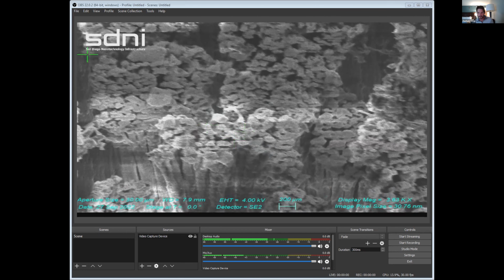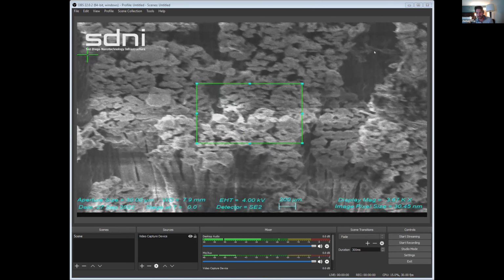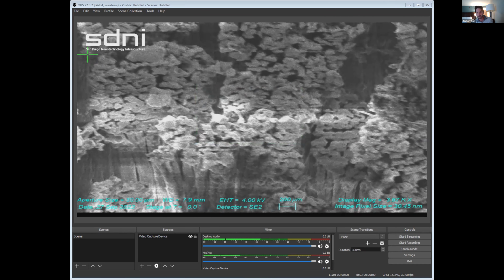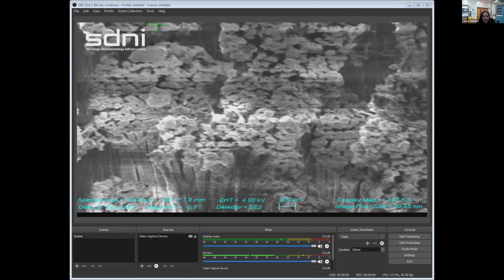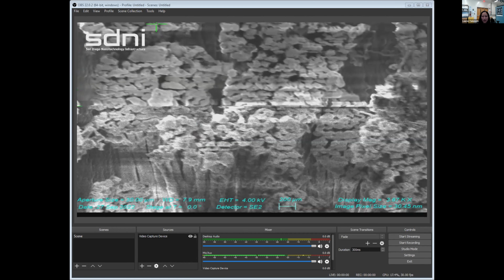And just while she's doing that, remember, she said the max magnification is 1000x of a standard microscope. If you look at the number in the bottom right, she's already about 4 times higher than the max you could ever get with a normal microscope. So she's already doing things you can't do with an ordinary microscope. Okay, I'm gonna put it at a slower scan rate so that the image comes out more sharp.